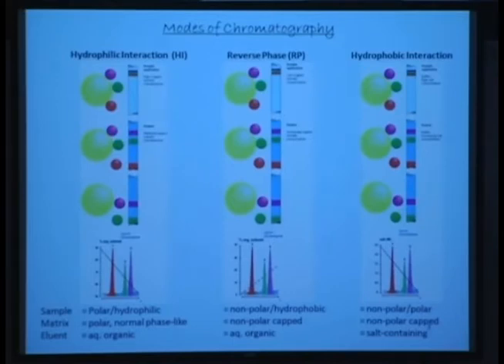By using high salt concentration to begin with, what do we have? We have a very high ionic strength of the medium, so all those groups that do not like high ionic strength would be forced together. And you engineer whatever weak hydrophobic character is in these glycans, you engineer better usage of those hydrophobic groups.